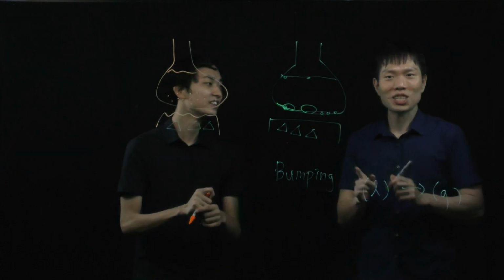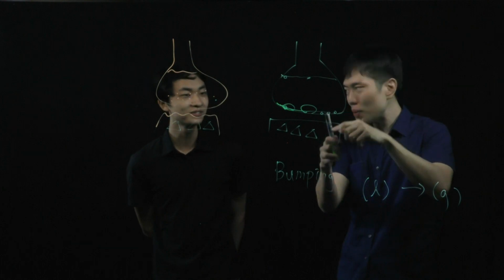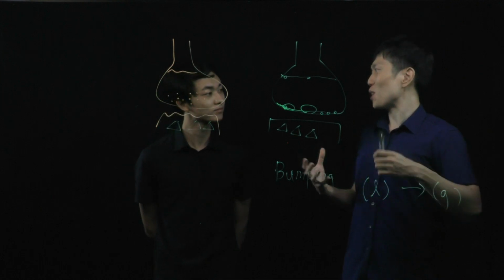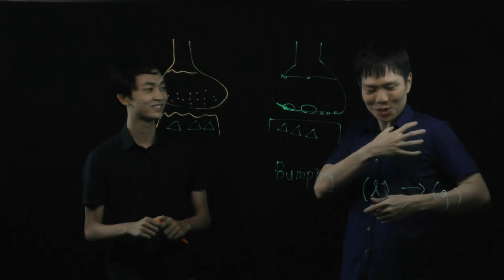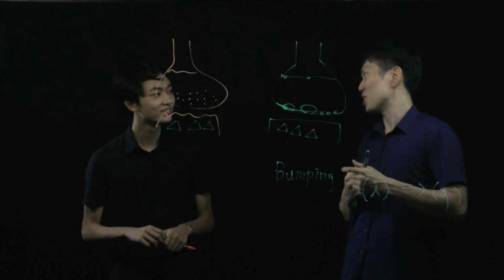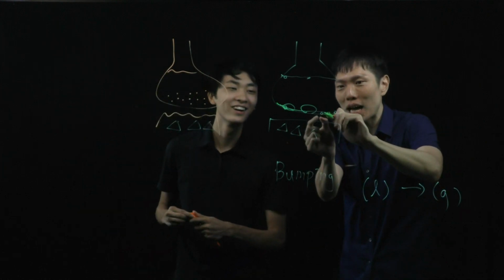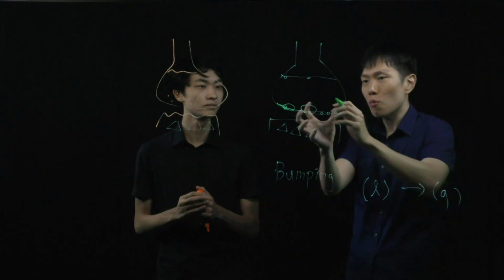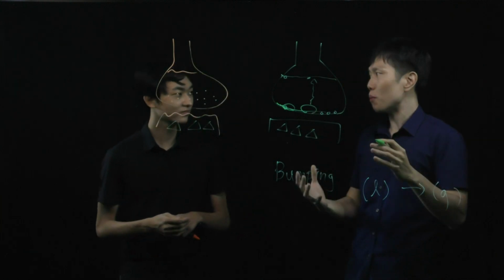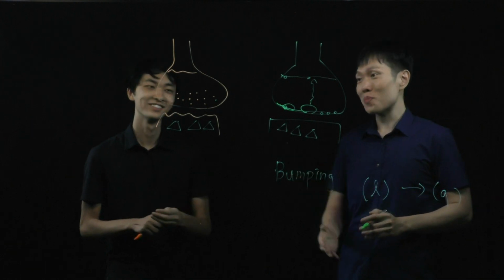So one key idea is that for bubbles to form, you need a surface. Normally you need a good solid surface, then you form a bubble there. Imagine in your childhood, in the bathroom, we play with soap and form bubbles. It's the same reason when you put soap on your hand, and then we combine and it becomes a bigger bubble. It's all about surface tension. So the small bubbles came out and combine and form a big bubble. But there is a point when the big bubble is not sustainable and it will just rise. When there are lots of these bubbles, it just keeps on rocking the conical flask. So that's why we are talking about nucleation sites.